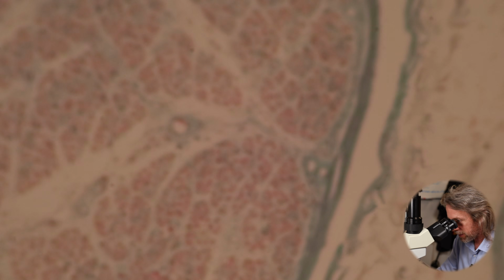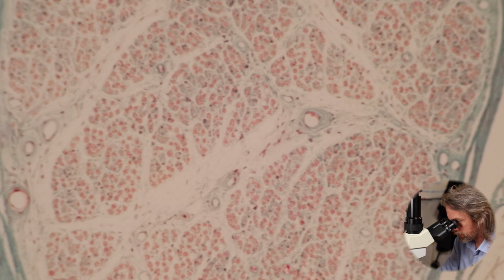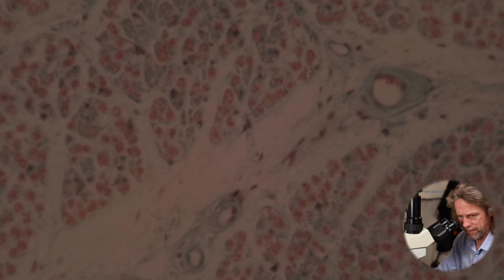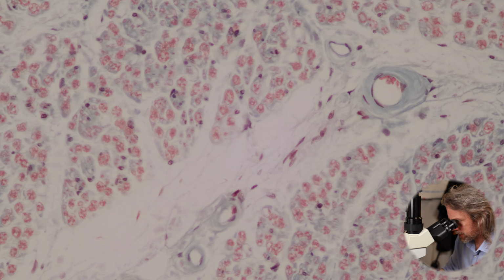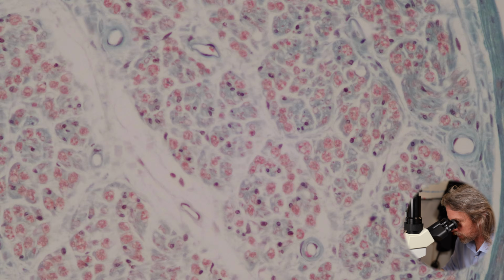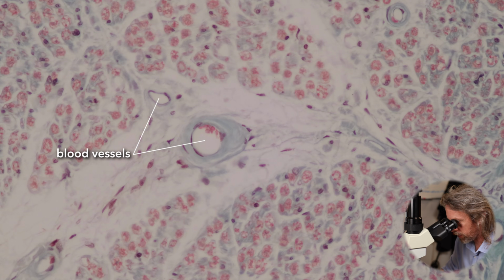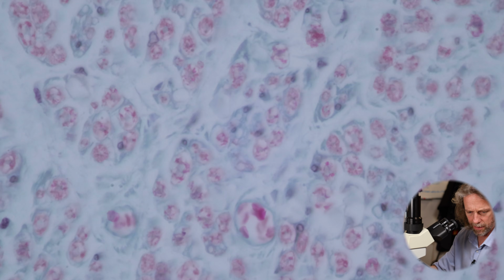As I zoom in, you can see that big circle has got lots of little circles inside it. If we zoom in again and give it a bit more light, you can see we've got lots of individual circles in there. We looked at blood vessels last week, so we're recognizing blood vessels there, right? Those circular tubes with space or bits of blood inside them. Now we're used to looking at blood vessels. But these little tiny circles, let me go to a higher power again and give it a bit more light.